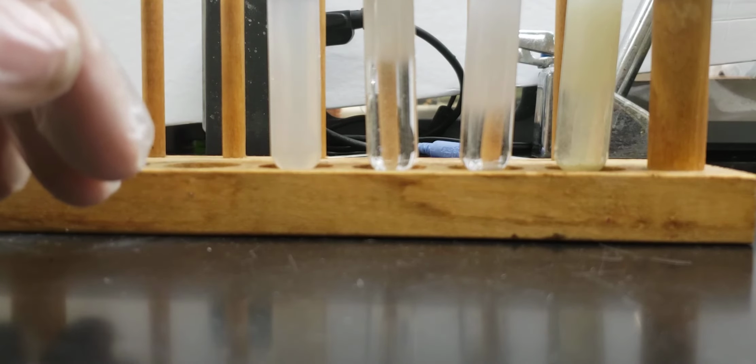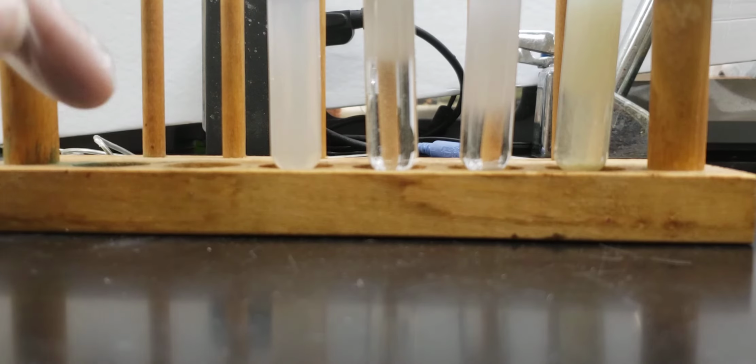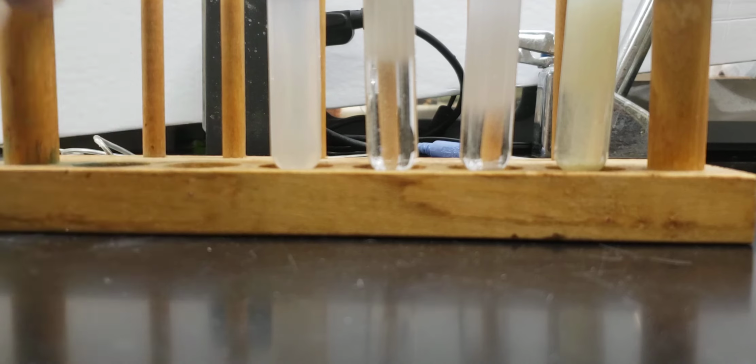Okay? And the high solubility means that it'll be affected when we add something that increases the solubility. Whereas the iodine, it has such a low solubility that by adding some ammonia in, it won't actually affect any of the dissolved solution that's in there.